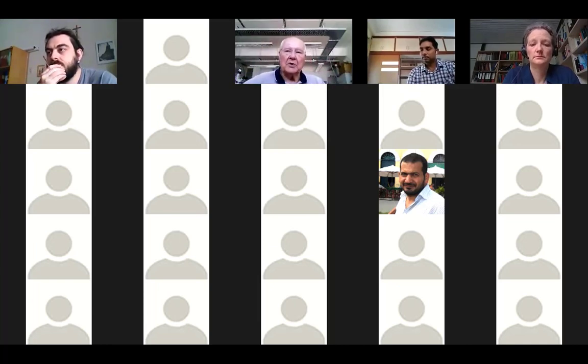Still, we are happy due to the total reflection effect. Such a high flux of photons coming in does not drastically increase the background. But this is TXRF, okay? The photons are used to excite, and therefore, of course, give you better conditions. So let me say, maybe it is a general statement.